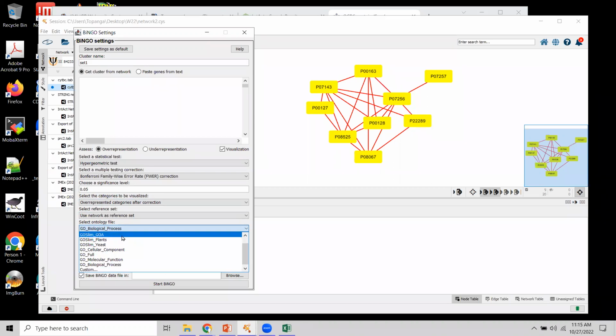Typically, what's useful is gene ontology biological process. This is going to be information about the pathways or modules or something with meaning in biology. Another thing that might be useful is cellular component. This might also provide you information on where the proteins are localized, and this might tell you something about what's going on. But the typical thing to pick is GO biological process.